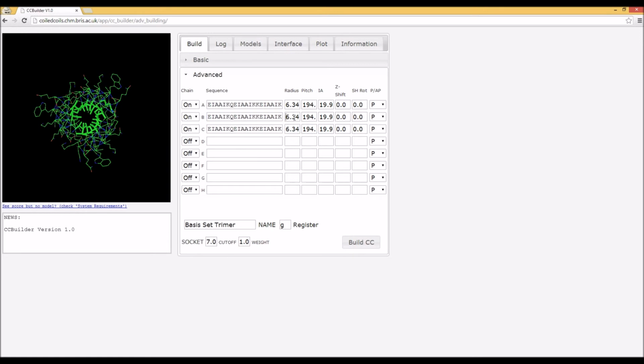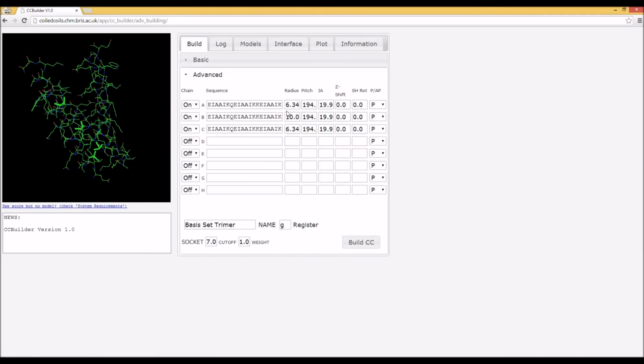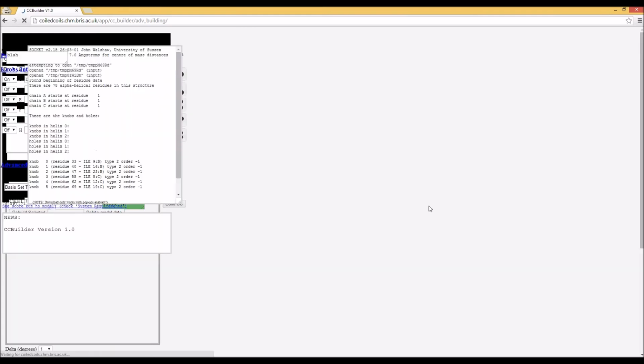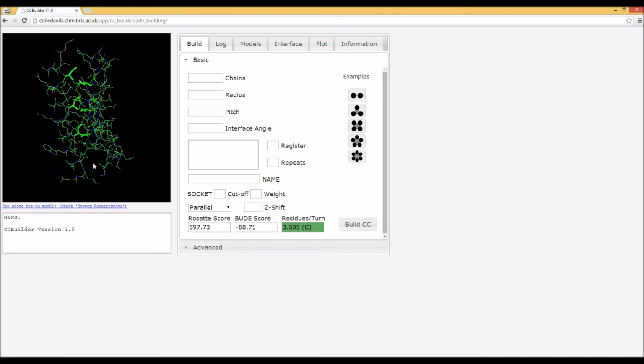And as well, you can modify values for one strand without it affecting the other. This can be useful for generating antiparallel strands with odd numbers of antiparallel chains, such as up-up-down trimers.